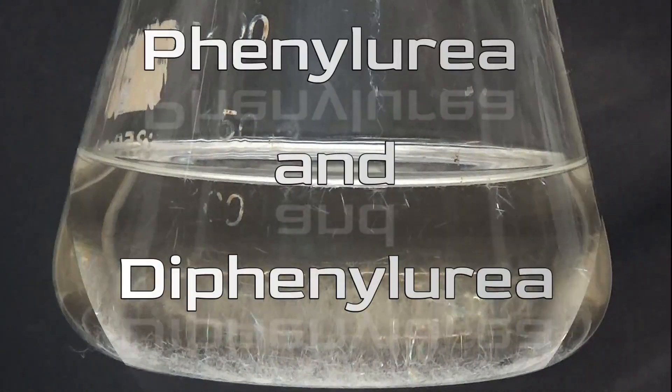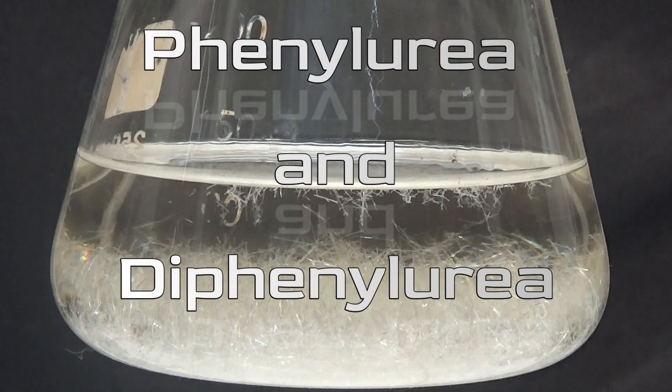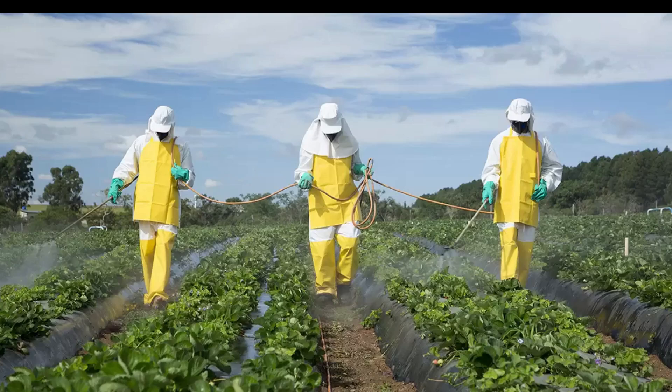In this video, we will learn how to obtain phenylurea and diphenylurea using the same process. Phenylurea belongs to the group of herbicides.